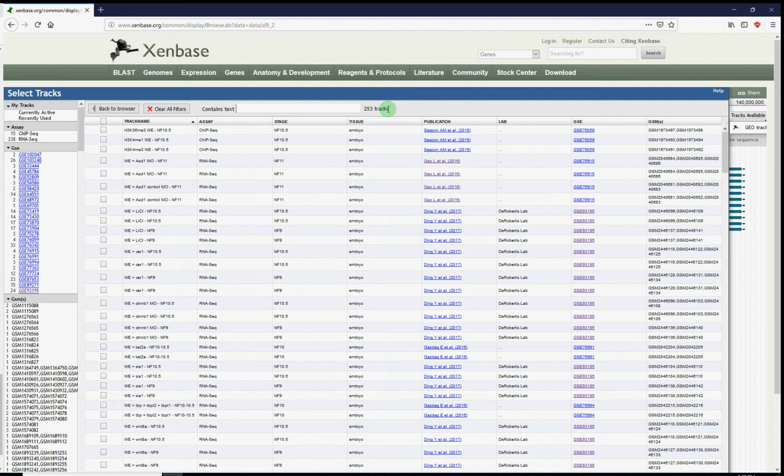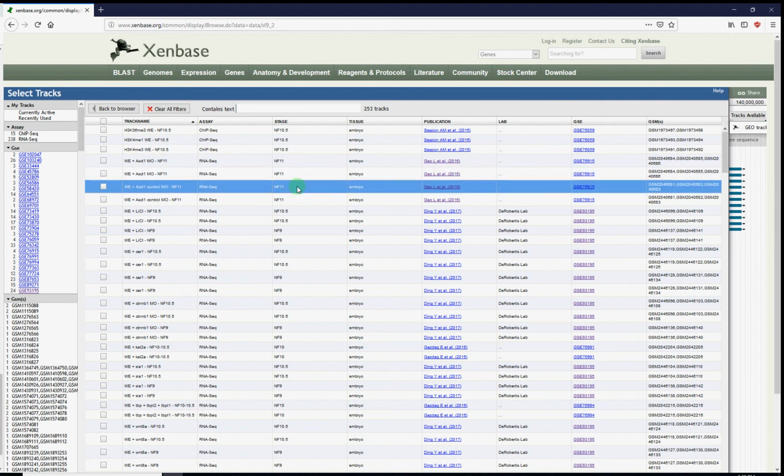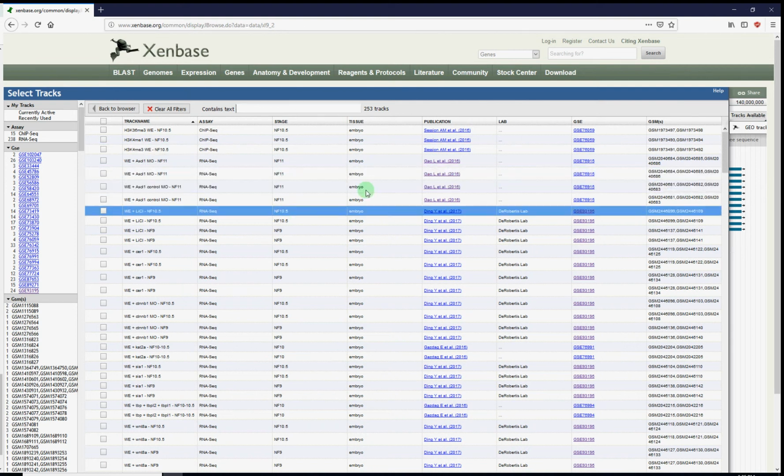These are only the bigwig data tracks from these GEO experiments, not the peak call tracks. So those peak call tracks you select only in the hierarchical track list as before. Now this will allow you to select tracks based on these metadata attributes. It also allows you a few helpful links.